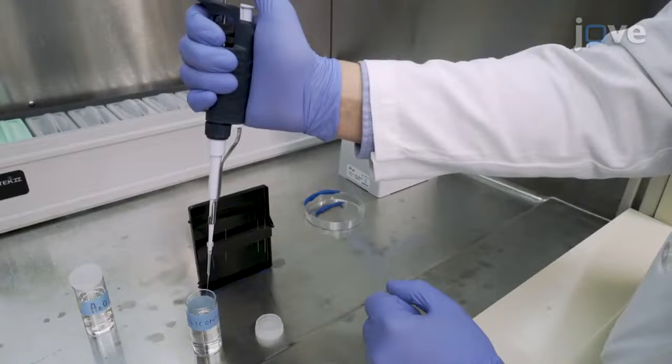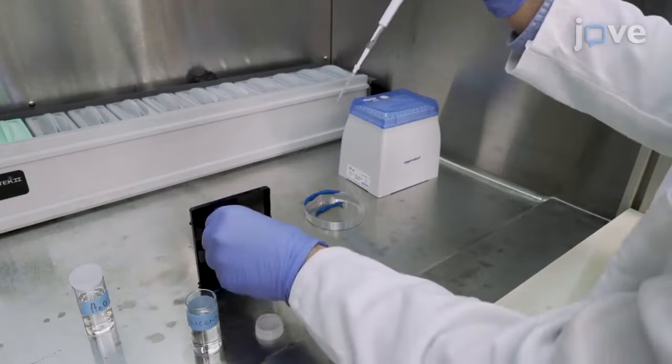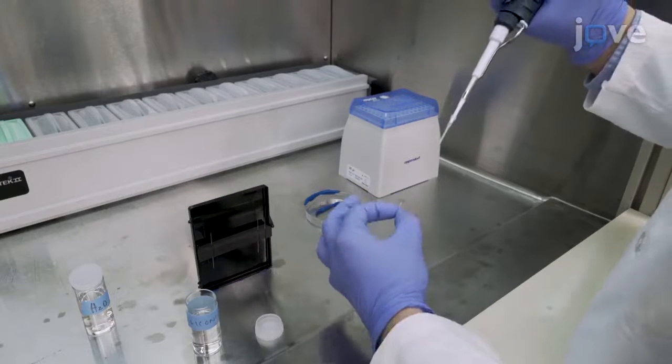Next, load 5 to 10 microliters of siliconizing agent into a micro-injection pipette tip and place the tip in the wide end of one externally coated pulled glass capillary.